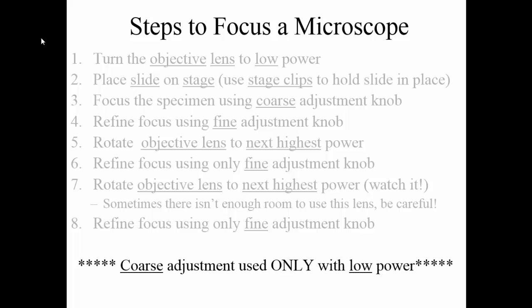A couple of reminders: the coarse adjustment knob is used only with low power — that's going to get you the major focus going. The fine adjustment knob is going to make slight adjustments. If you cannot find it on low power using the coarse adjustment knob, you are not going to be able to focus it on medium power or high power. A lot of times your instinct is to say you can't see anything on low power so you'll try the next one — don't do that, because it's going to be even harder to find something on medium power since you now have a smaller field of view. Make sure that when you're focusing, you find something on low power before you move to medium power.